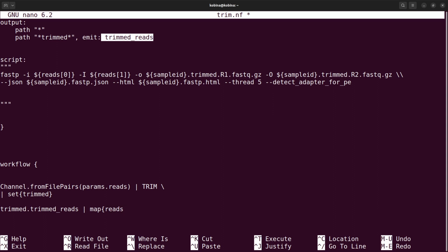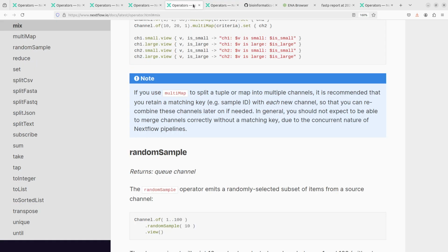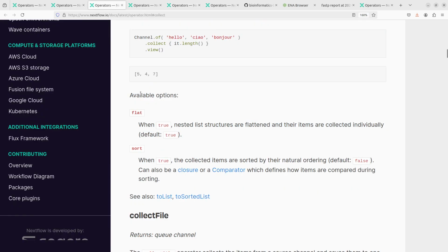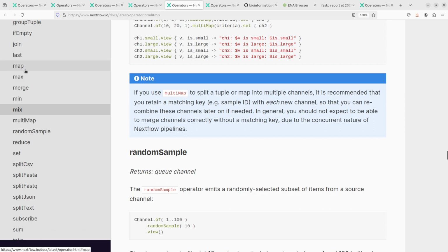So basically what we are doing, that's the outputs, which are the paired end reads. That's what we are mapping. So mapping, let's even look at the explanation first. It's important. We'll come back to it. Map should be somewhere here. Let's just check it out. I had it here. Let's see.